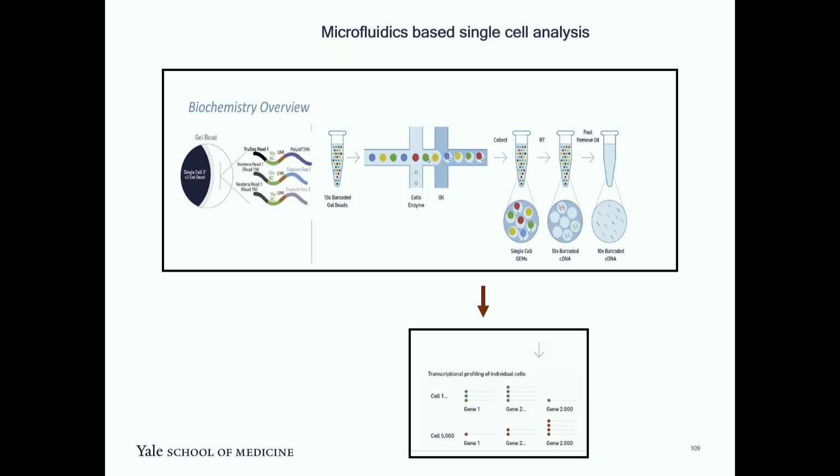So in the case of microfluidics, the idea is that we are still barcoding cells, and then doing the rest of it. In this case, there is a bead. This bead consists of an adapter, and each bead will have a unique barcode, and then some other portions. Then you send it through a microfluidic chamber that has 3 inlets. From one side your bead will be coming, from other sides the reagents and cells will come, and from the third side the pressure inlet and oil is going, and a pressure is exerted.